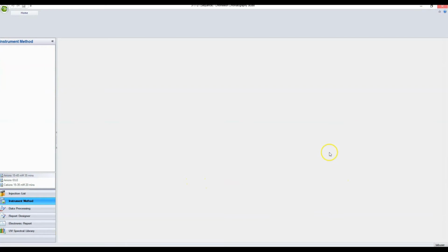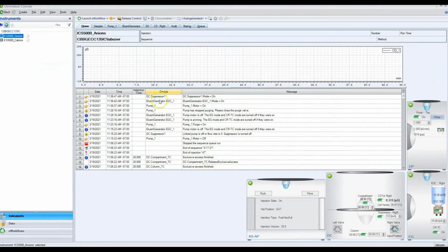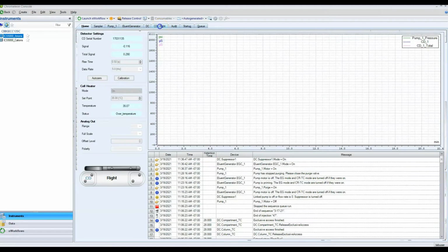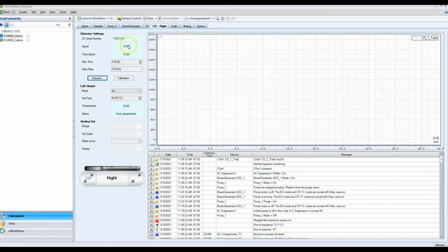So basically we've set the instrument to the settings that we want, and now we need to let it equilibrate, right? We want a really flat baseline before we start the run. And what we look at for that is our conductivity detector. So I'm going to hit auto 0, and then I'm going to monitor baseline. Now this is going to start measuring this number, and this is our signal. And basically we're good to start the instrument when this signal has stopped changing. And you usually want this total signal to be as low as possible. Anything less than 1 is usually a healthy column. Anything less than 0.5 is pretty good. If we can get it down to like 0.2, 0.3, you're doing great.